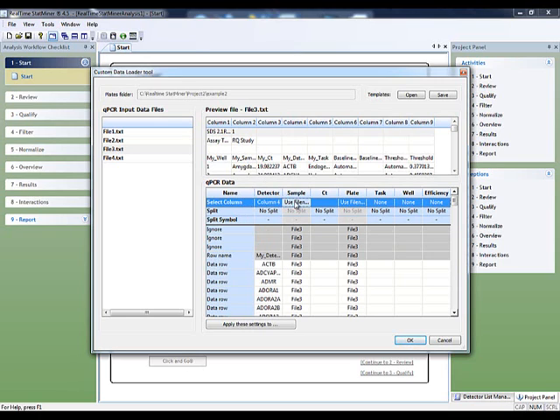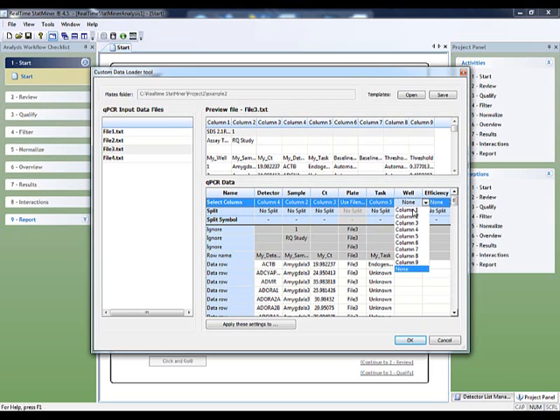We cannot apply settings from former files because in this case columns are not following the same order. Plate column is not available within the file, so file name will be used instead. We don't really expect to repeat this process every time we run our analysis. As we will see later, all this configuration can be saved to use at a later date.